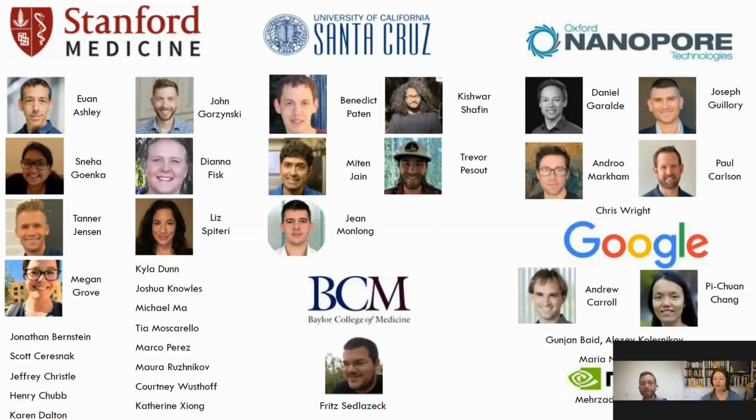Thank you. And we will wrap up with this final question. Are there specific standards used in short read sequencing that assure fidelity of the sequences compared to the reference sequences? Yeah, so I think this isn't necessarily a question for short read sequencing, but we can talk about it in terms of any type of sequencing. There are always going to be quality metrics that are used in order to ensure that the sequence that is being aligned to the reference genome is in fact appropriate to be used. And there are many different types of quality metrics.